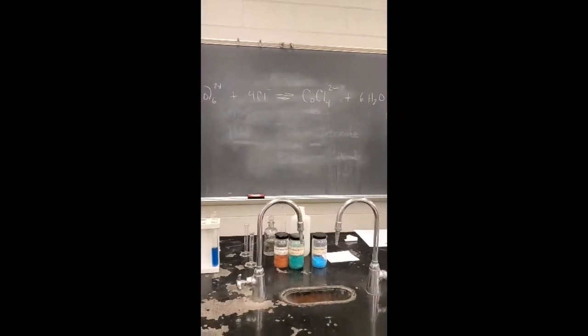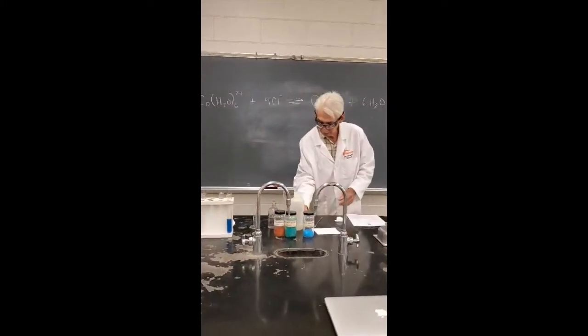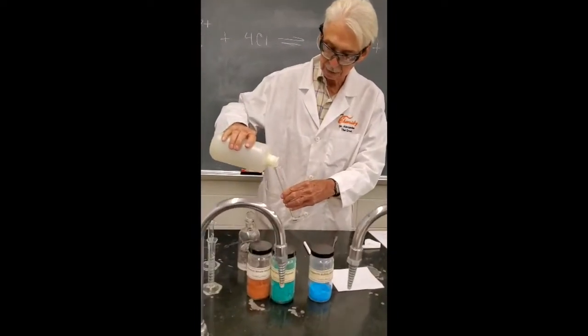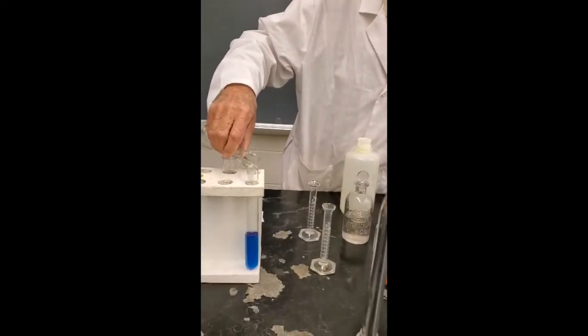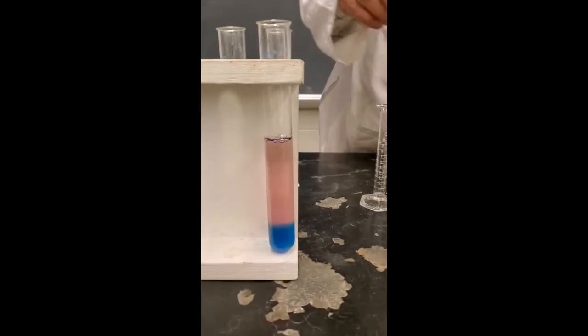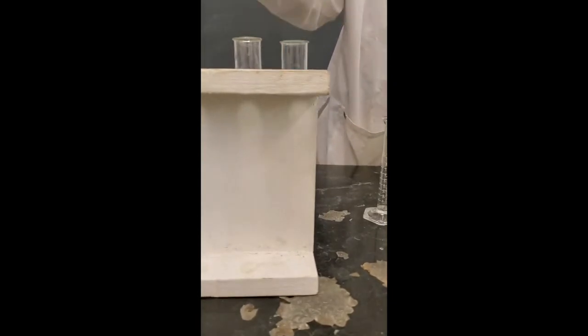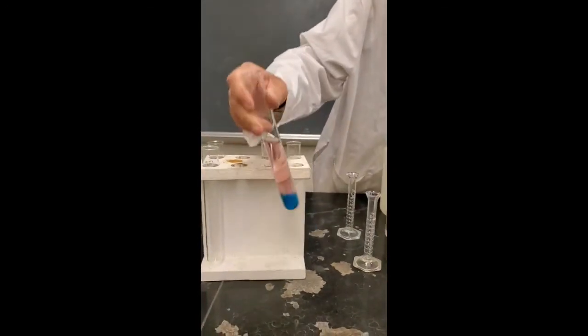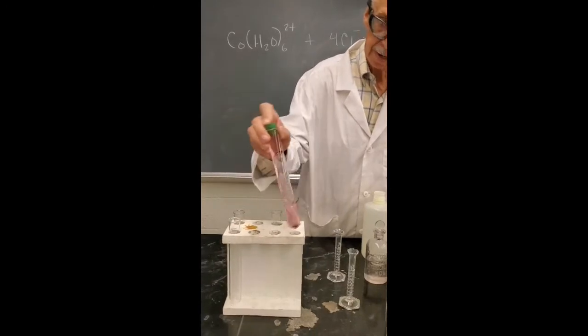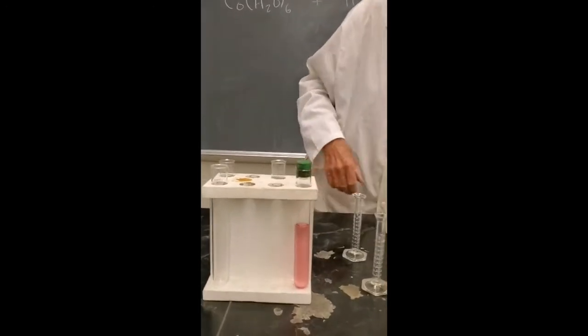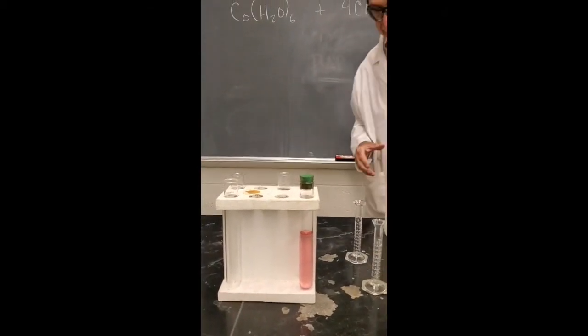According to Le Chatelier's principle, if you add water, you should shift the equilibrium in the opposite direction. So let me measure out a little bit of water in here. And I'll add it and see if there's any evidence that it shifts the direction, the opposite direction. You see the top? You can already shift to the top. The top bottom more dense. That's pretty, isn't it? Let me stir this up a little bit and you'll see. Isn't that something? I got a stopper. I'll turn this upside down and you'll see it equilibrate. See, it's almost all back to the pink now. We've had enough water to make it go backwards. And the illustration of Le Chatelier's principle.